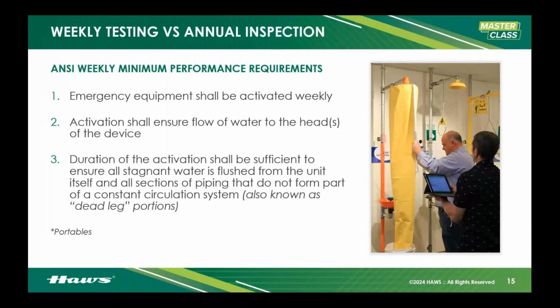Okay. You've got to go to the unit. You have to make sure it's filled with the correct amount of water. You don't have to actually activate it. You just have to make sure it's filled to the fill line per the manufacturer, right? Because that's how you're going to get your full 15 minutes.